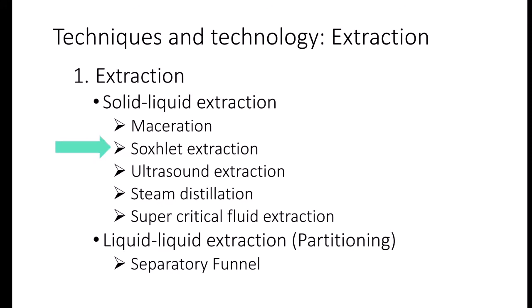solvent throughout the extraction. The advantage of this system is that tipid siya sa solvent because it is recycled within the setup. It also takes a shorter time, around 2 to 3 hours only. This method is time and cost efficient, however, it cannot be used for collecting compounds that degrade with heat. So let's watch some video clips of Soxhlet extraction.